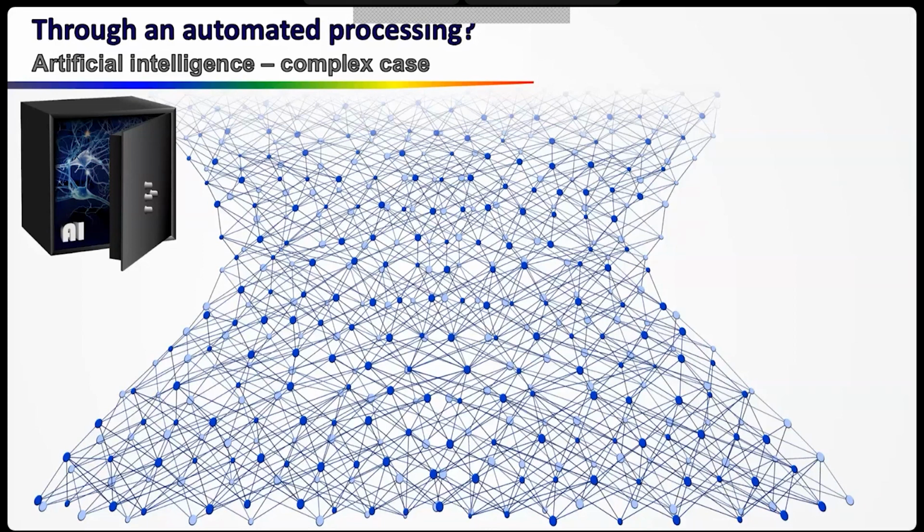So you can expect to have a much bigger algorithm in terms of number of neurons, layers, and so on. And so then you need much more reference spectra for the training. And at one point in LIBS, it is not possible because we don't have the samples. We cannot buy a sample to say, I want this proportion here. No, this does not exist.